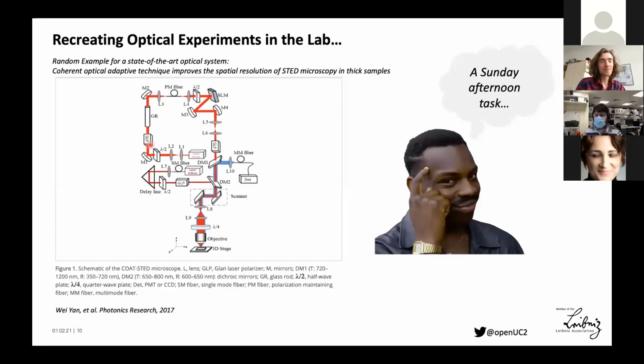That's hardly possible. Too many mirrors. The positions of the mirrors are not really mentioned anywhere. Also the brands and everything. So it says lambda half plate. I don't know which one is used here. So how could we solve that?